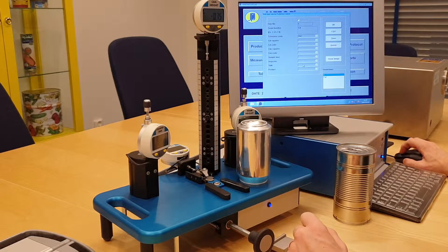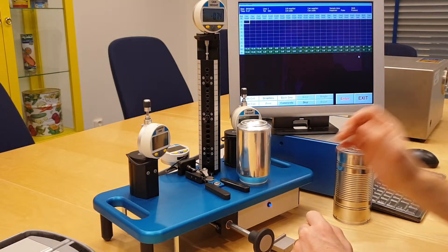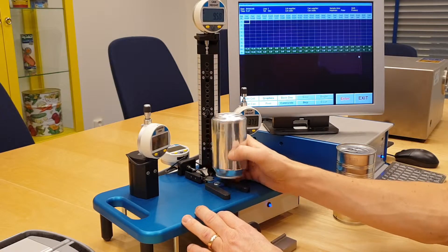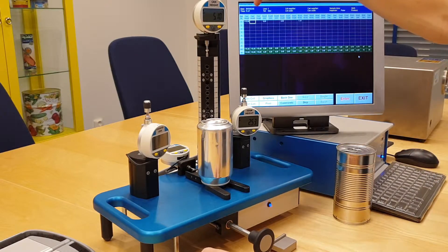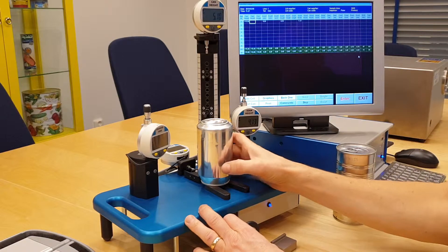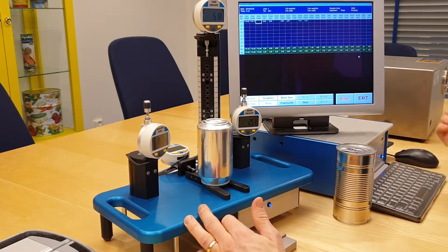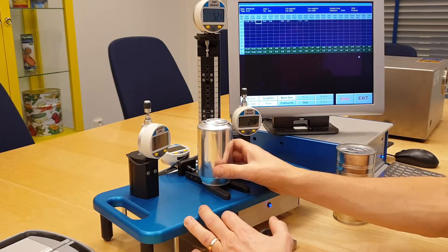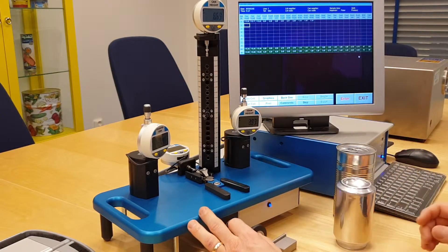Eight cans. The test table comes up. You simply put the can in position and you see how fast it reads all four parameters. You release, turn the can, release, and turn it once again. Finished. Can number one finished.